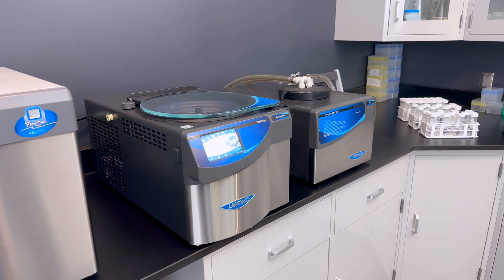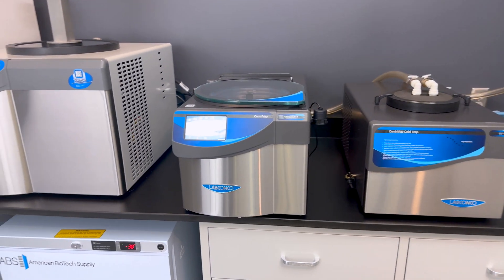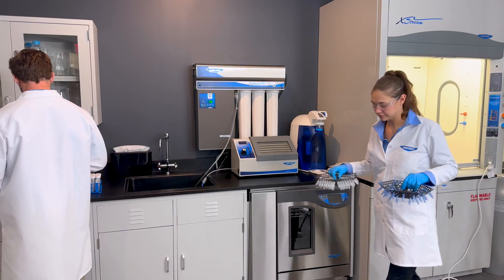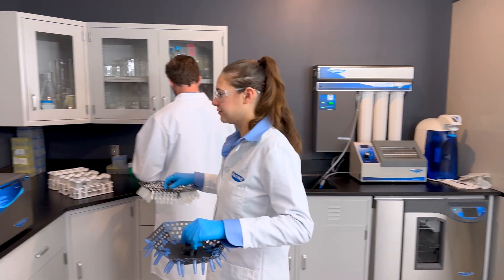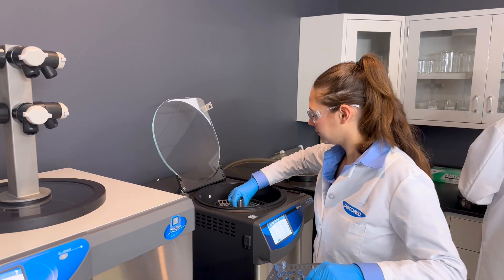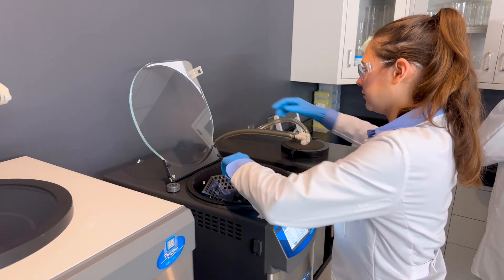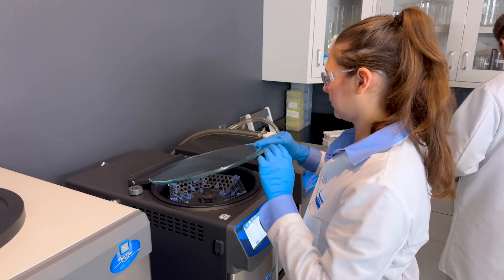The newly redesigned Centrivap puts you in control of your workflow with a suite of innovative new features. Improve your sample throughput with our new stackable rotor system, available on select models — you can now process up to 296 samples at once without taking up extra bench space.